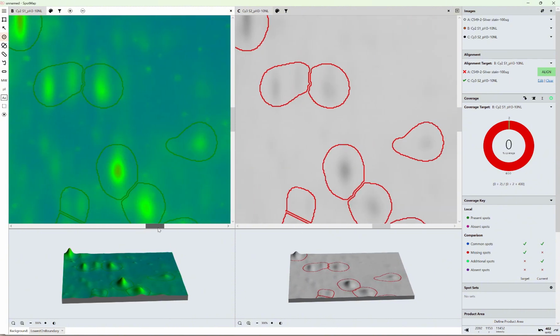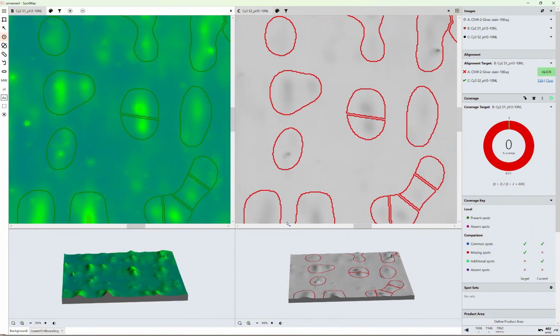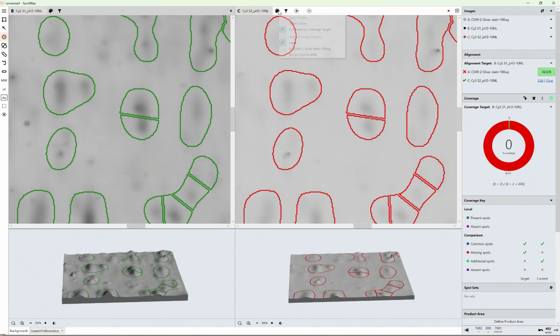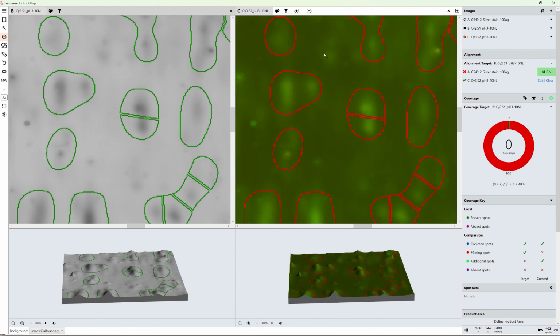And then the third method of visualization that we've got within our software to allow users to better work with their data is actually the ability to overlay the two images or multiple images that you're working on all at the same time. So if I just set this image back to normal black and white, because otherwise it's quite distracting for the video, if I come to the overlay config section of the image, down here to second image overlay, I can actually stack my images on top of each other.